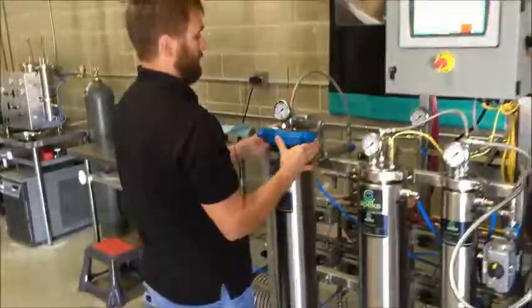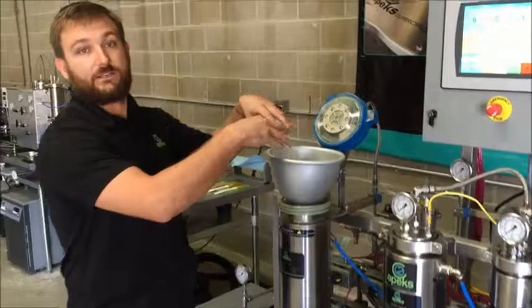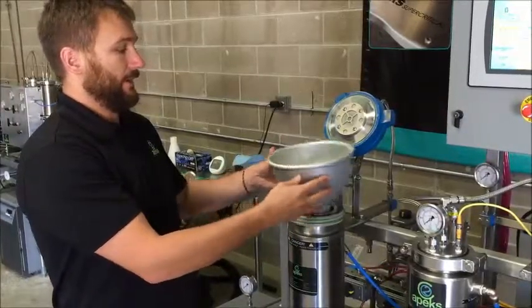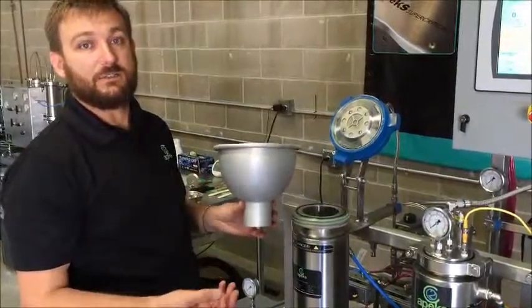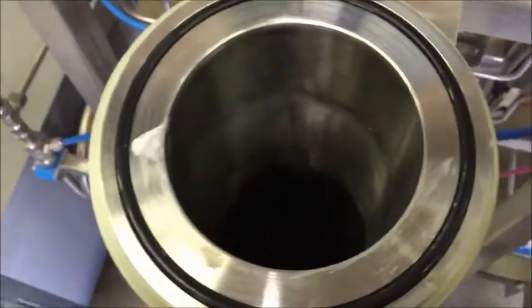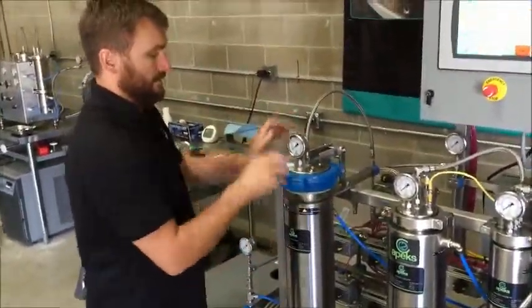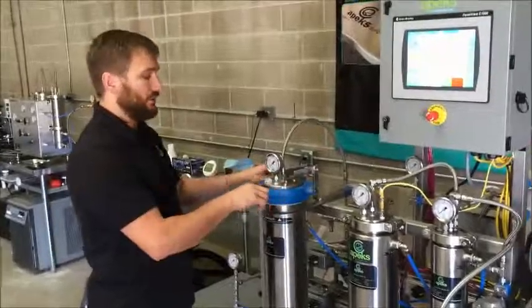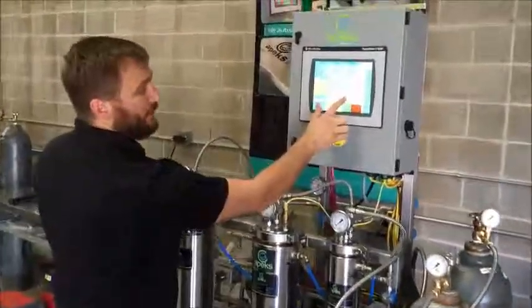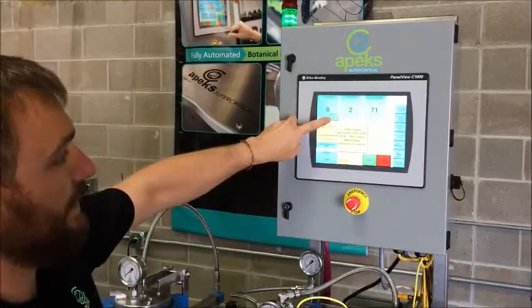To start up: before we hit start, we'll come over here to our extraction vessel and open it up. We supply a funnel that comes with every system. We will load our plant material in here — there's a grinding video on YouTube showing me actually loading an extraction vessel. We recommend coffee-ground-sized dried plant material. After we load our material, we close this. On our new system we've made recent design changes — all you have to do is go hand-tight.